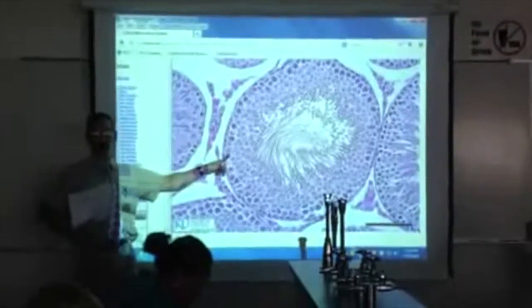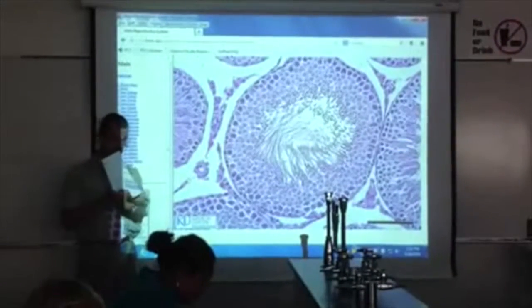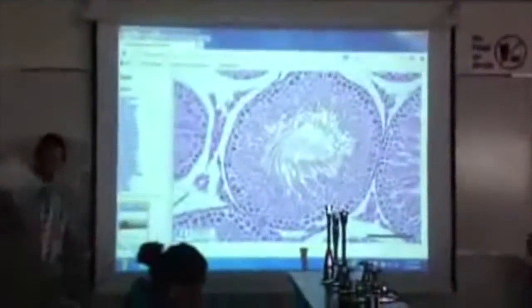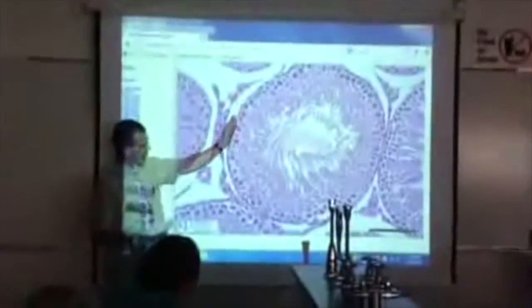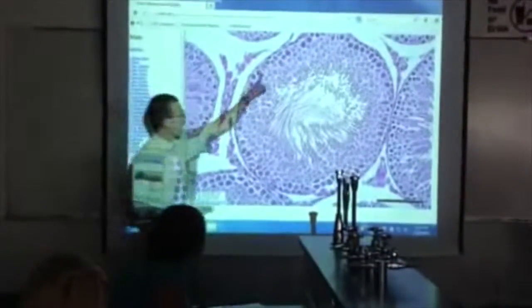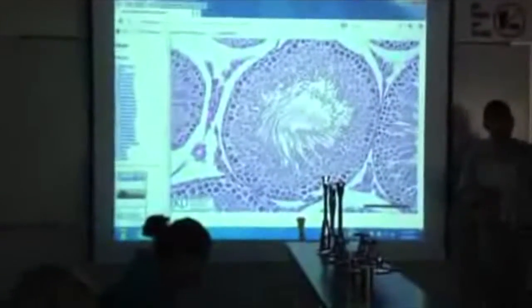Spermatogenic. You can say spermatogonia, spermatogenic, sperm mother cell, stem cell. They're all basically synonymous with each other. The cells in the ring are making the sperm and shoving them down the tube. So these ones on the outer part of the ring are going to be your spermatogenic cells, spermatogonia, whatever you want. Okay.